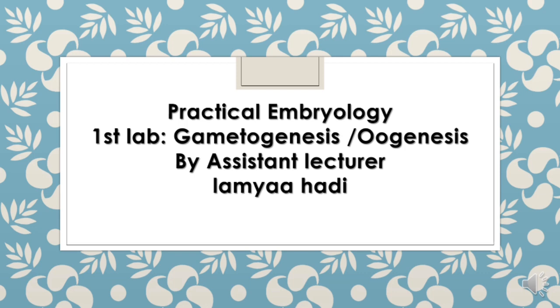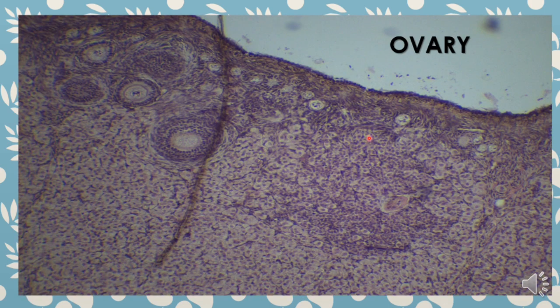I will talk about the first lab of gametogenesis, oogenesis. The first slide, the ovary.